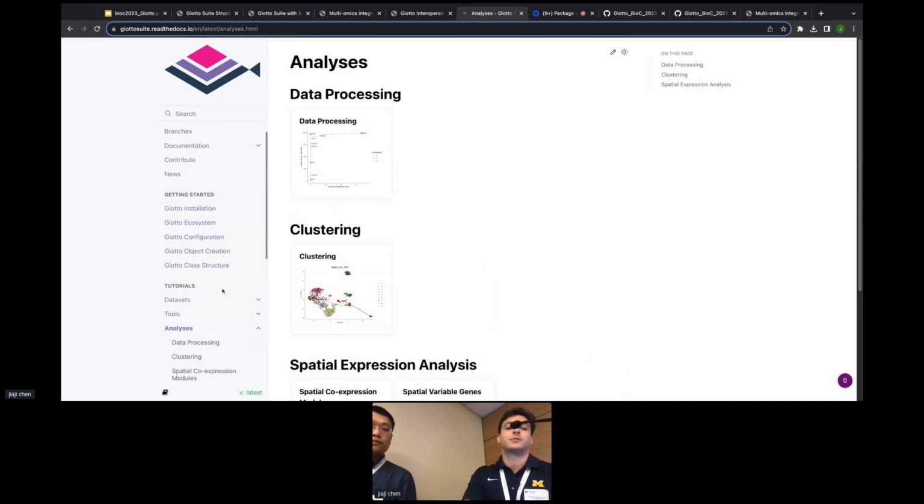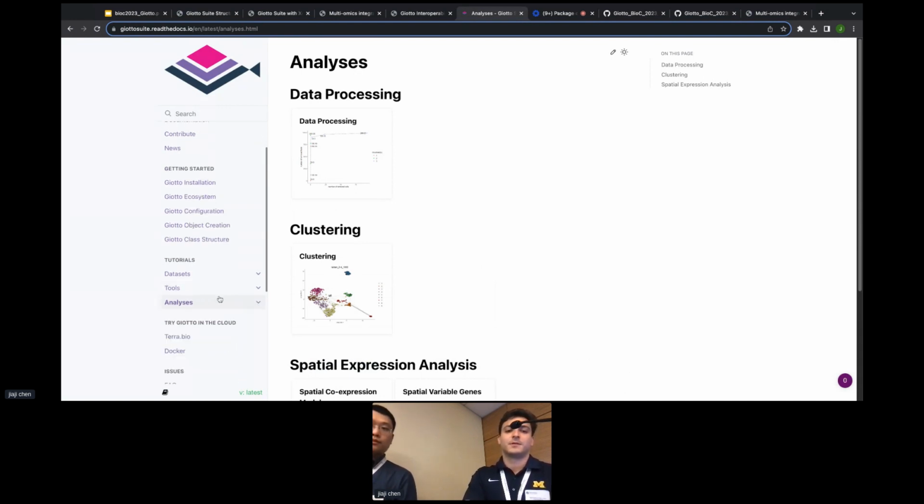The data sets are going to encompass workflows from both tools and analyses in a full-on analytical workflow. So going through getting started, tools and analyses first will orient you to then being able to use it at your own scale. Thank you very much for your time and attention, and we'd love to take any more questions if there's remaining time.